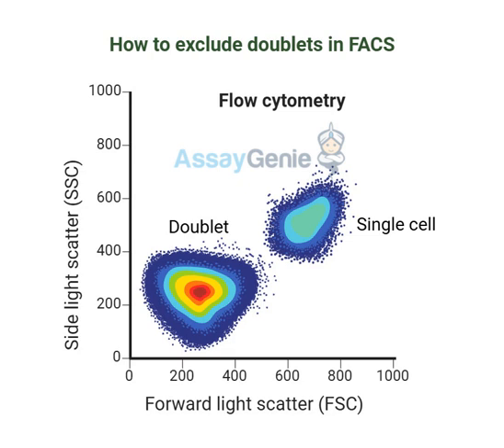Wait, gates? Yeah, think of them like checkpoints that the cells have to pass through. I get it. If a cell's measurements don't match up with what a single cell should look like, then it gets flagged as a potential doublet, kind of like being sent to timeout.